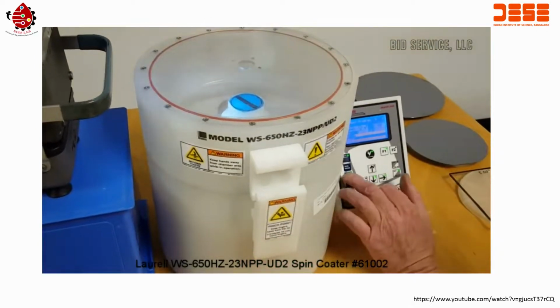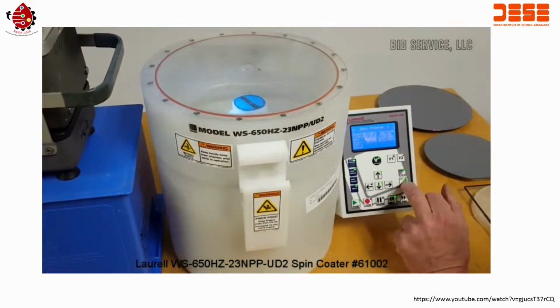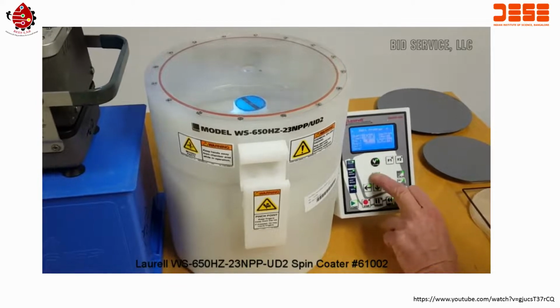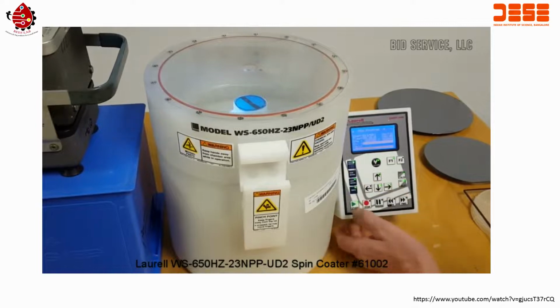What I'll do in this one here is I'll double that to, let's say, 8,000 RPM. And we will repeat.